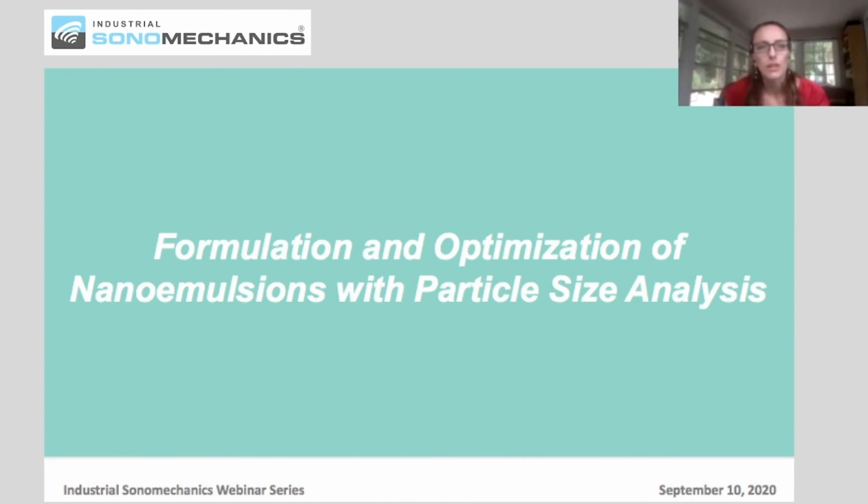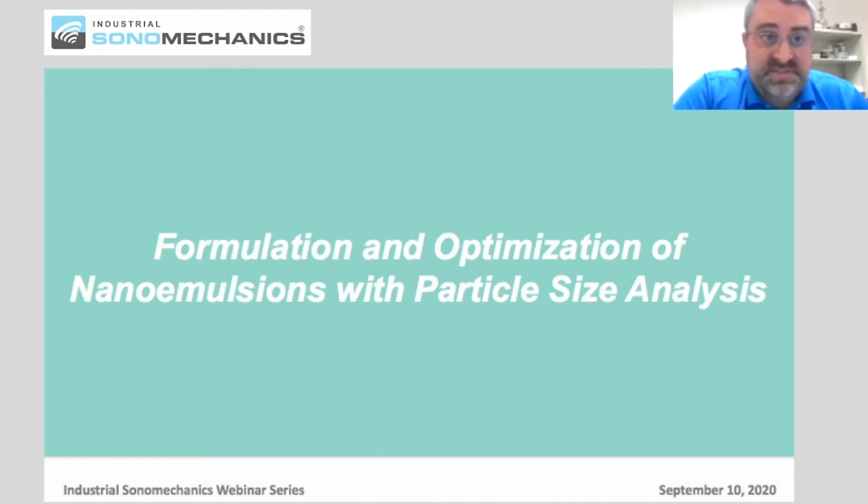It looks like there is an overlap in the size range around 100 nanometers to 500 nanometers between laser diffraction and dynamic light scattering. Does it really make a difference which instrument we use? Yes, it does. Actually, I'd say yes and no. The reason there's an overlap is that, of course there's going to be an overlap, but going back to the physics of the instruments and the engineering of the instruments, they typically use red lasers. Red lasers are about 630 to 660, 670 nanometers in wavelength.